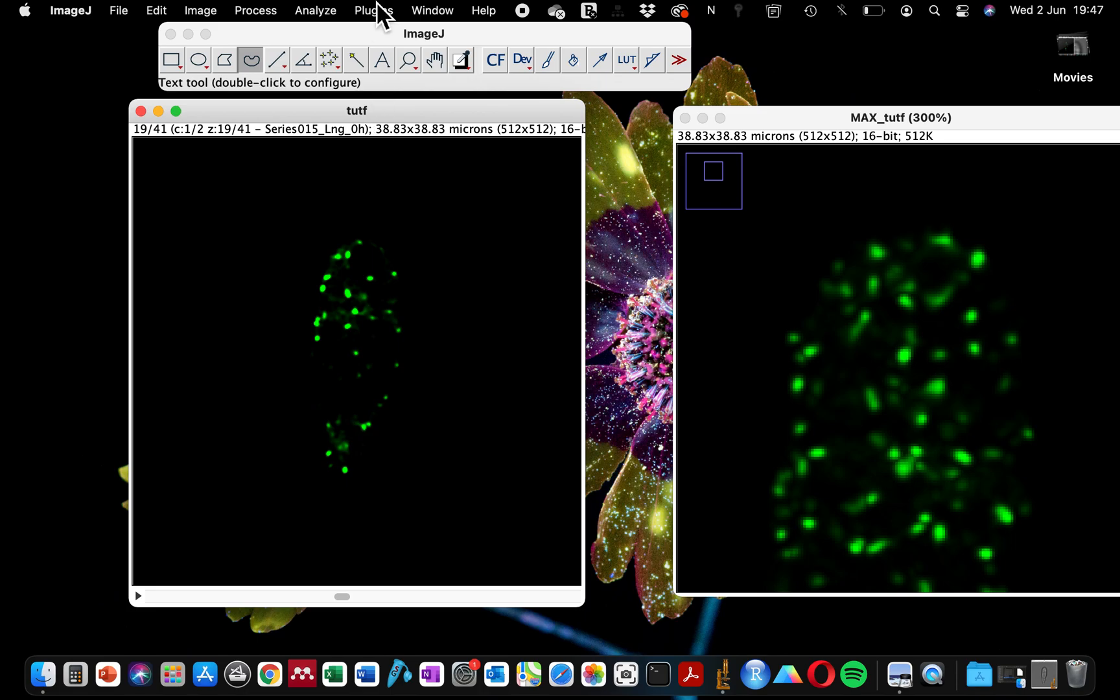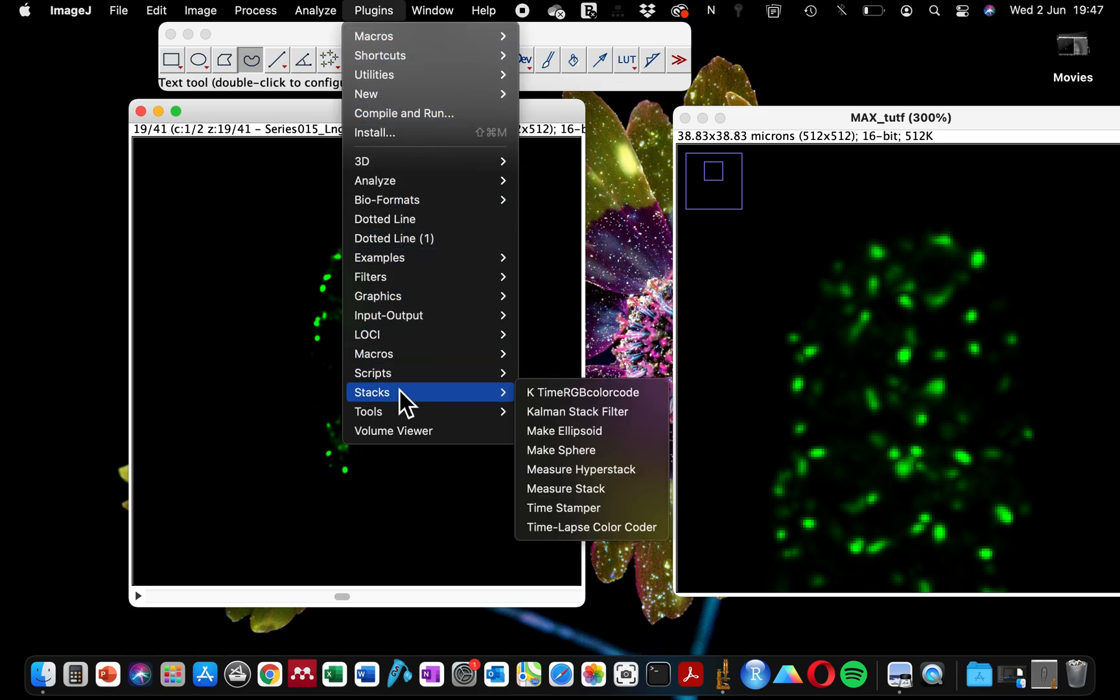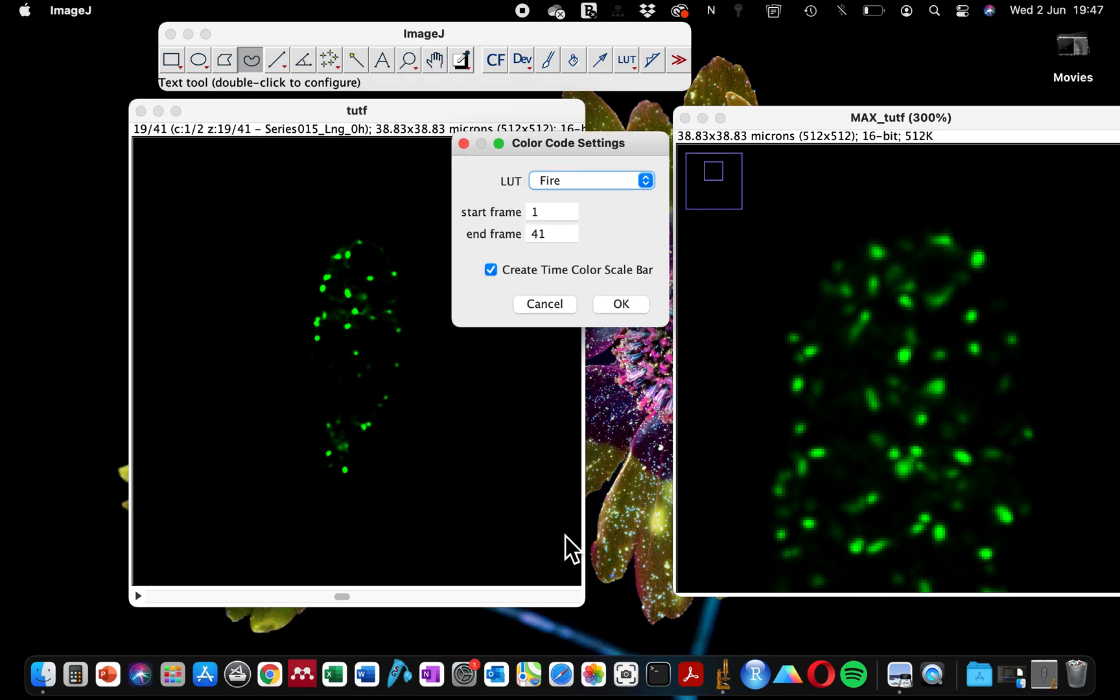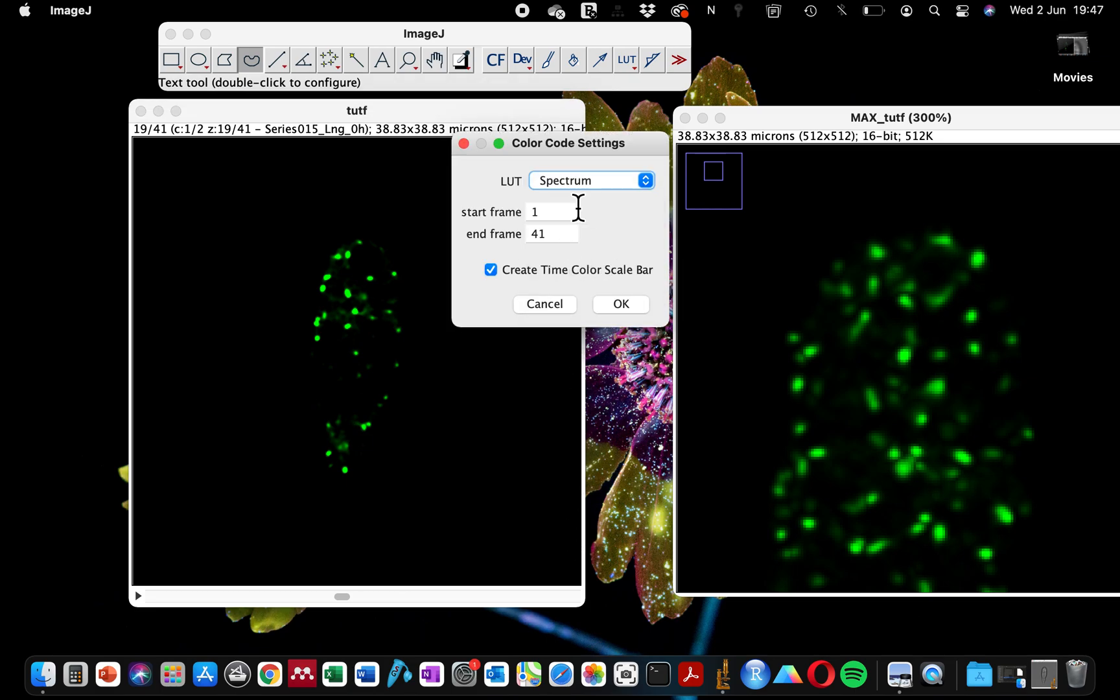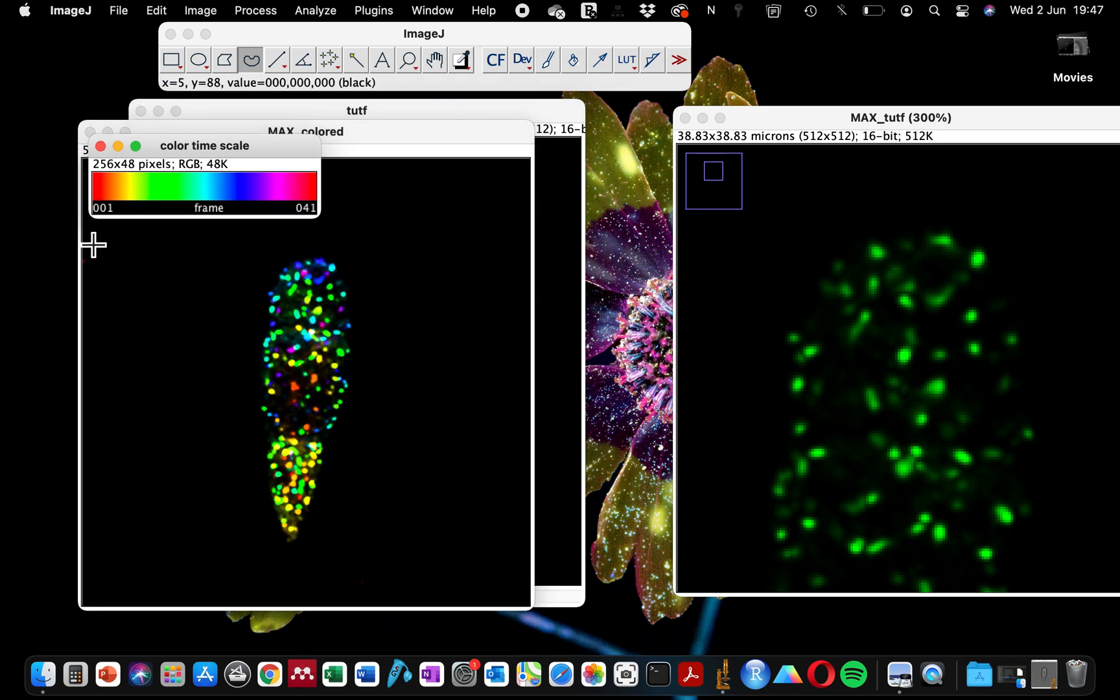I'm going to repeat this process by going to Stacks, Timelapse Color Coder, and I'm going to be choosing Spectrum. If you select Spectrum, this will allow you to have your samples displayed in different colors.